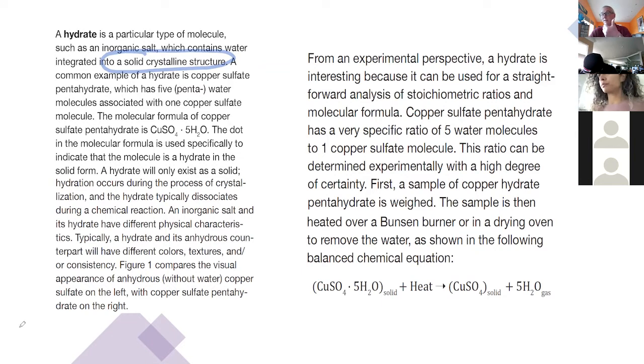It makes it heavier because it's not just the metal and non-metal in there. You also have water in the mass of the hydrate. It also will change its color a lot of the times. It'll change the texture. Generally, salts that don't have water in them are a lot more brittle. And so texture and consistency are a lot different. Generally, hydrate crystals are a lot larger and more uniform.